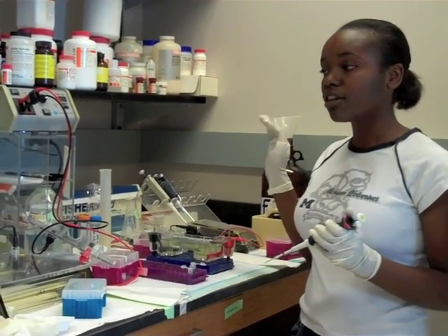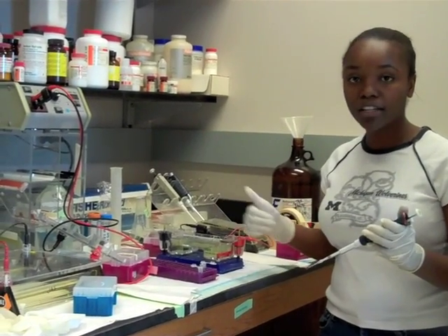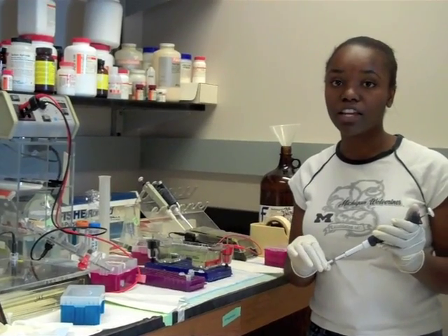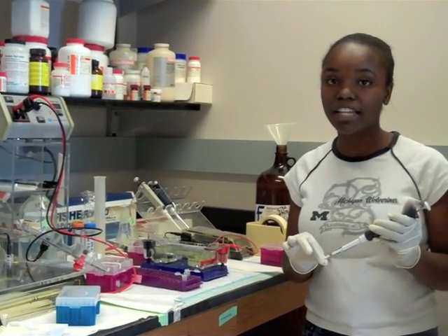To load a DNA sample on the gel, we amplify the DNA, and what I am about to do is put it on the gel and run it through so that I can see whether our amplification worked and whether we ran the right DNA.